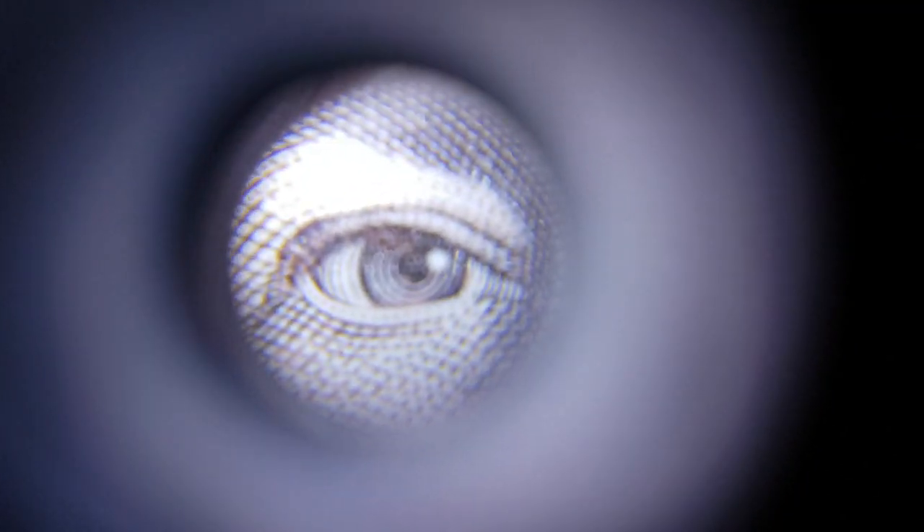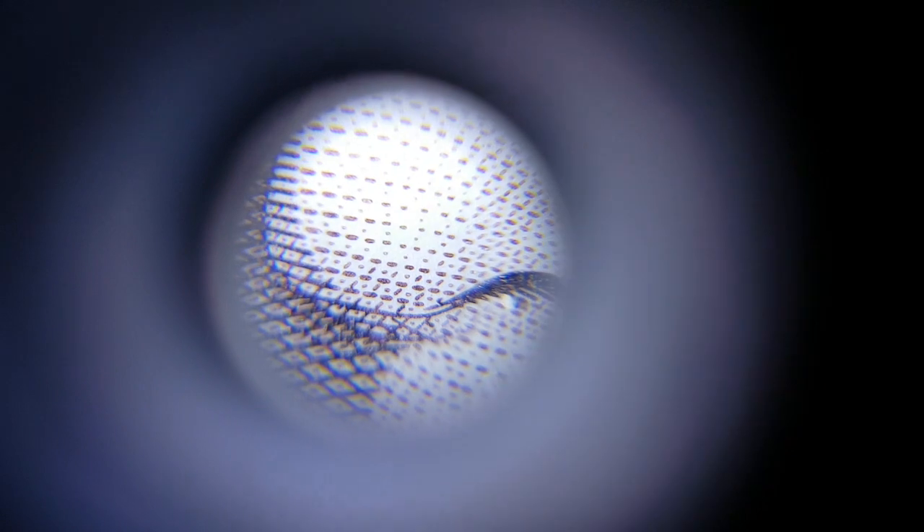I wonder if the light will overwhelm or blow out the camera. I'm in the dark — let's turn the little light on the microscope on. Oh hello, there's the queen. It's not so bright that it overwhelms at least my Samsung S7.